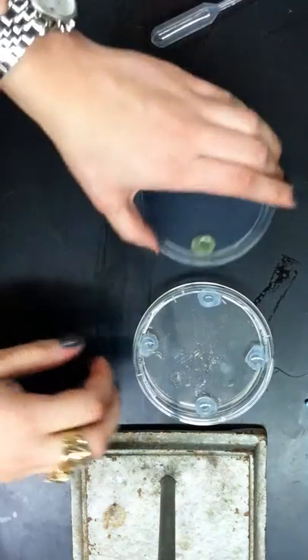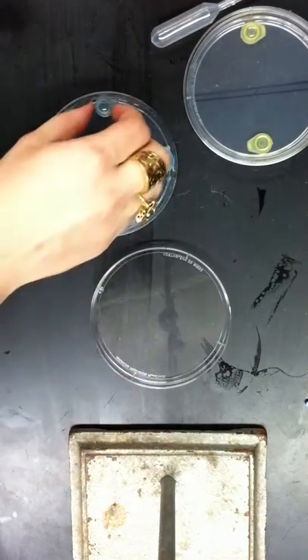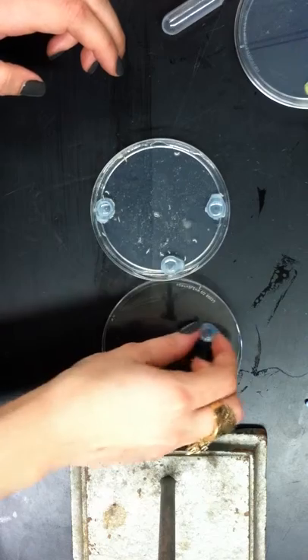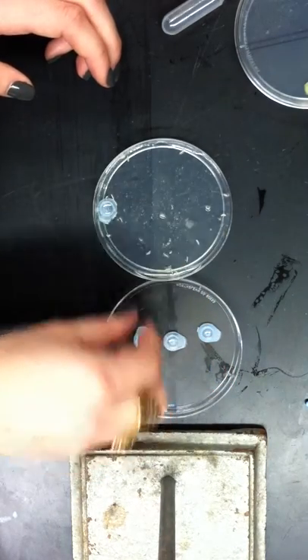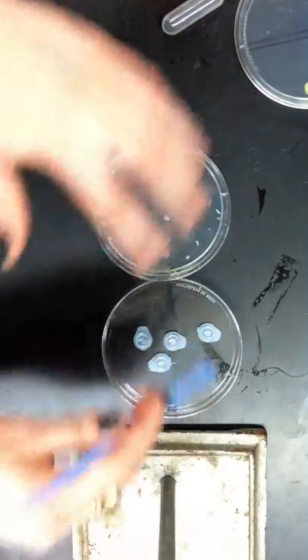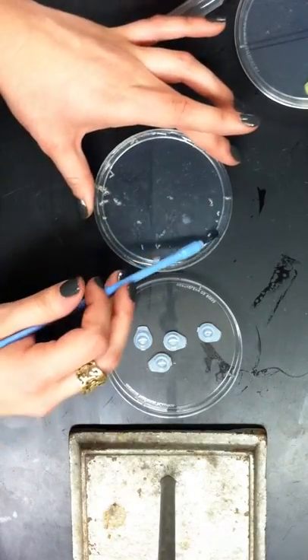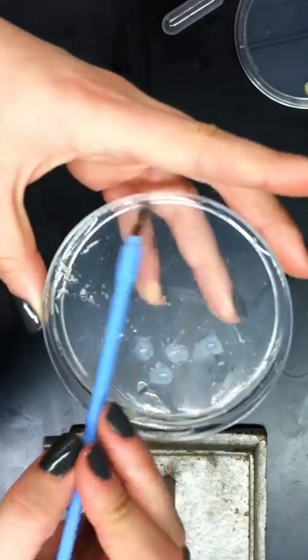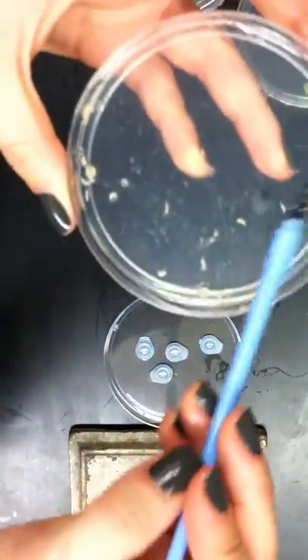Once it reaches five minutes, you're going to open up the testing plate and remove the tops to get them out of your way. Now the larva have crawled all over, have been exposed to the scent and the fructose plate, and you want to gently remove the larva from the plate. The agar is kind of slippery, so this part isn't too difficult.